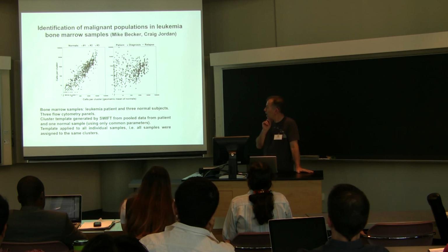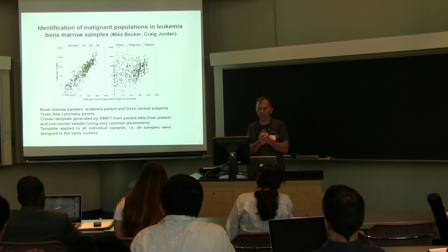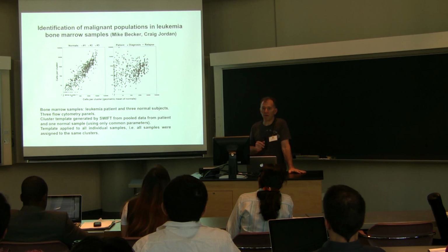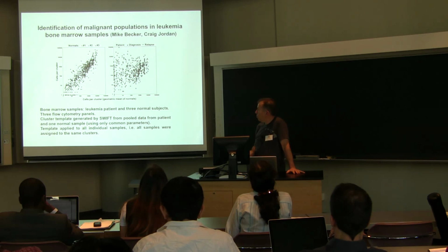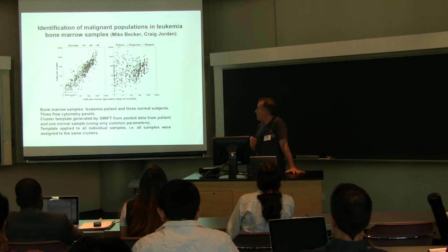What we did here, by doing concatenations and sampling of various samples, we can construct consensus samples or idealized samples in a lot of different ways. So it's a very flexible way of producing a reference sample. And what we've done here is produce reference samples from multiple normal people. And on the left are 3 normal people, each plotted in terms of cells per cluster against the average of the 3 normals. And there's a reasonable correlation there. They're all reasonably similar to each other.